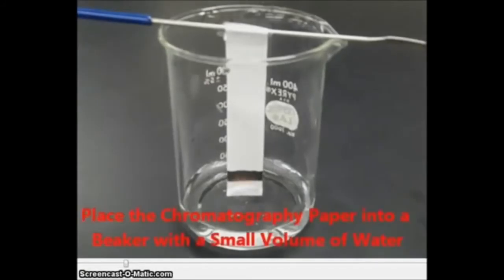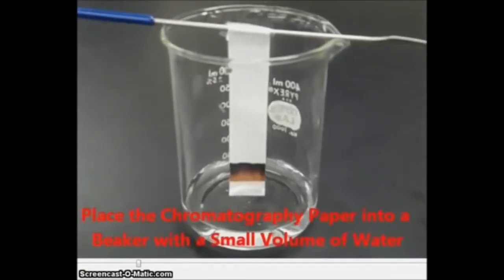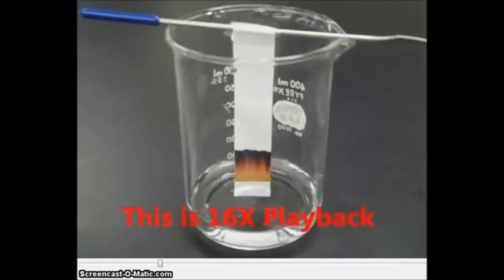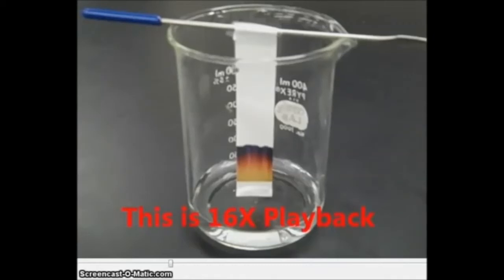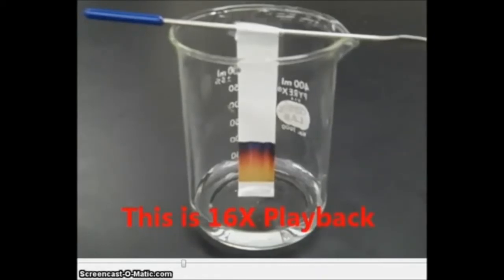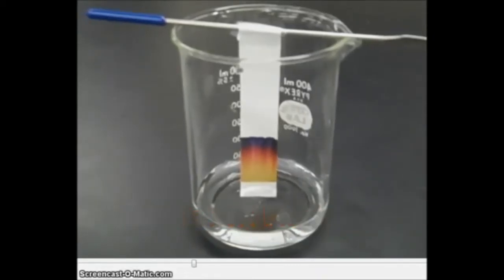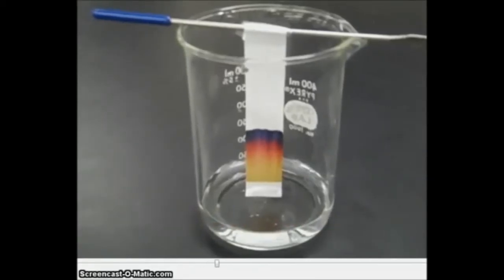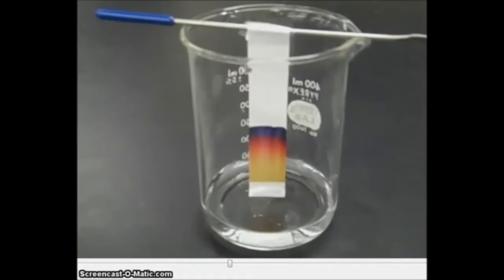Then what we want to do is insert that chromatography paper into a beaker with a small volume of water in it. We can see that the water will start to rise up the chromatography paper because of capillary action. You'll note this is happening very quickly because this is 16 times speed playback. We can see that the ink, which originally looked black, is starting to separate into different colors.